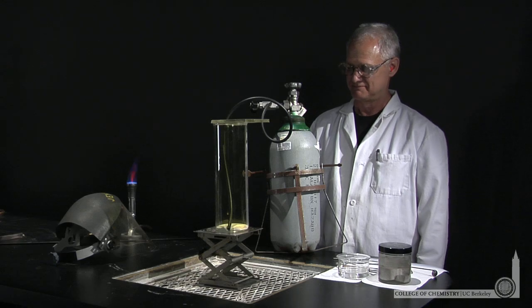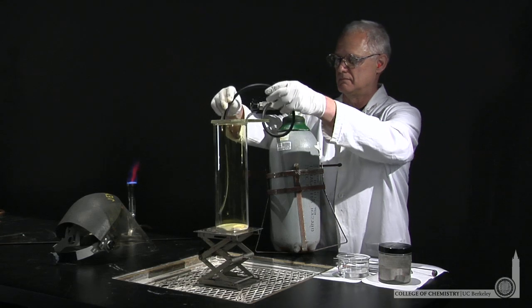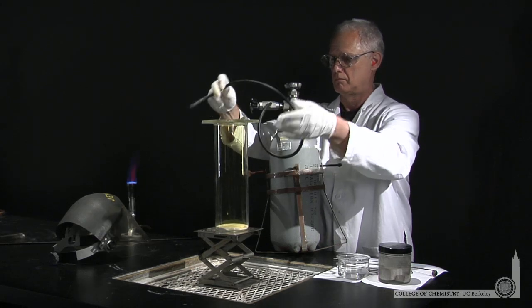We've asked Lonnie to demonstrate the formation of an ionic bond — in this case, the bond between sodium and chlorine in sodium chloride. Lonnie's filled a beaker with elemental chlorine. That's chlorine gas, Cl2.